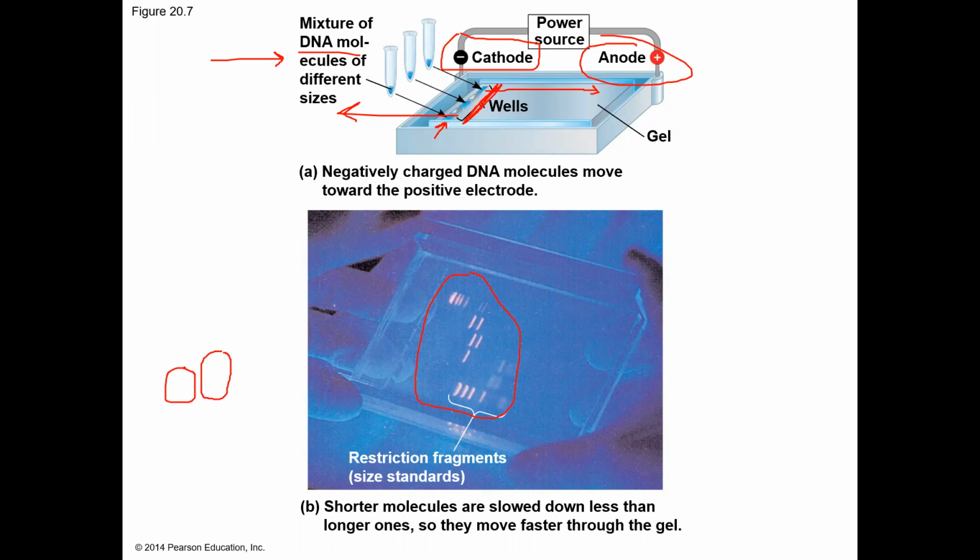So the recombinant plasmid size is going to change based on that DNA that you added in there. And the old adage, and again, I know this is pretty hard to conceptualize just sitting at home looking at this, but the bigger the DNA fragment, the slower it's going to move in your gel.